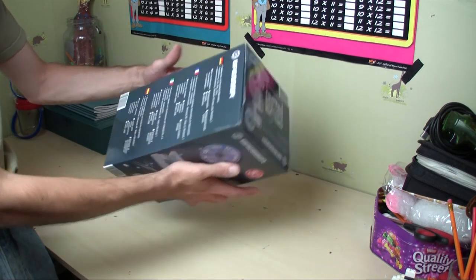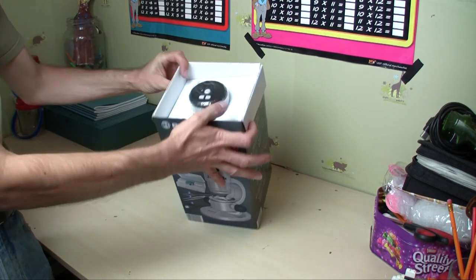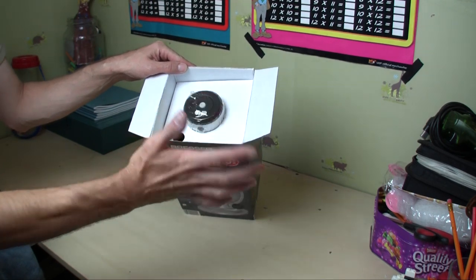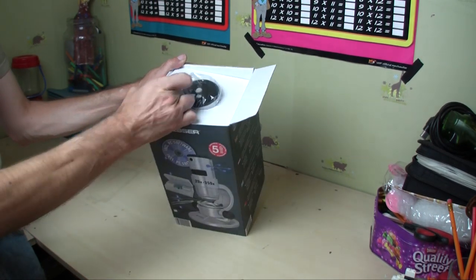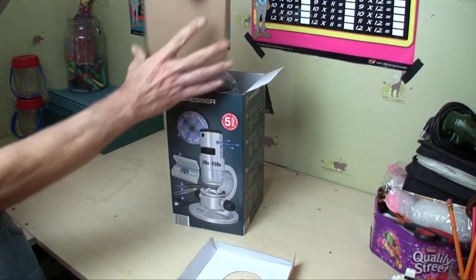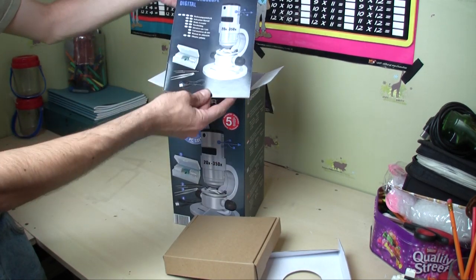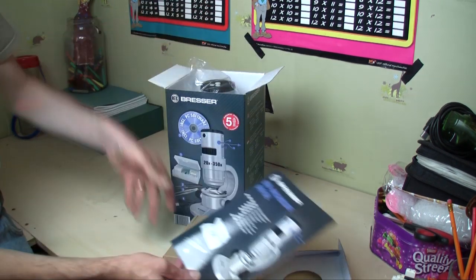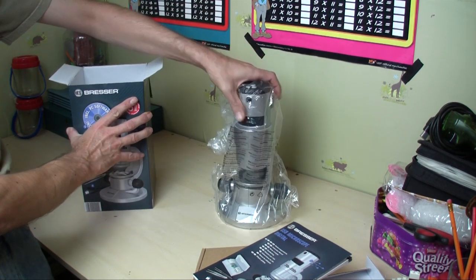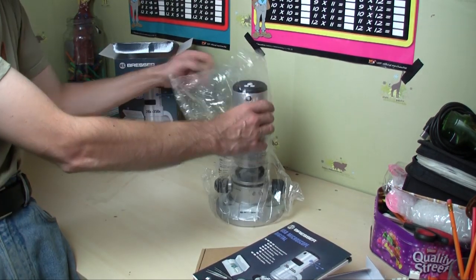It's quite a bulky box but quite compact. We'll open it up and straight away you see the top where you've got the on-off button and controls for making it lighter and dimmer. Let's take this all out. So in here we have a box of goodies — and the microscope itself.